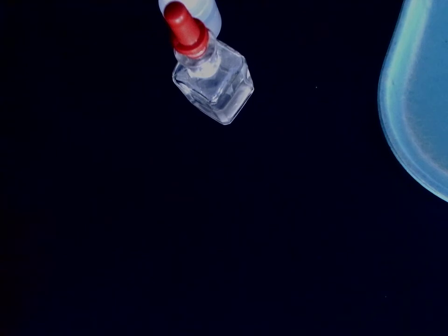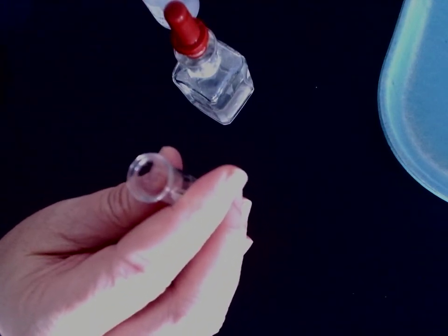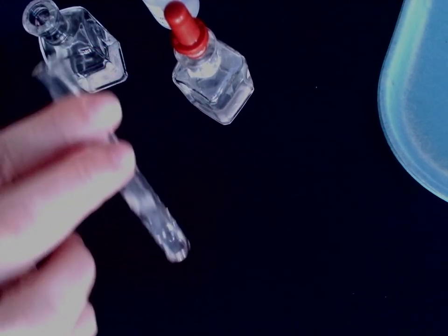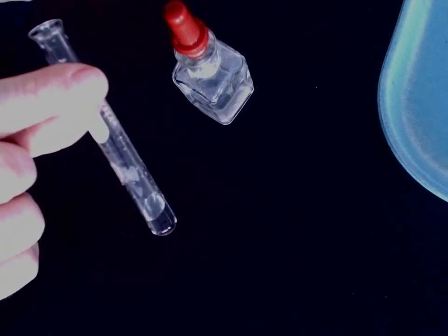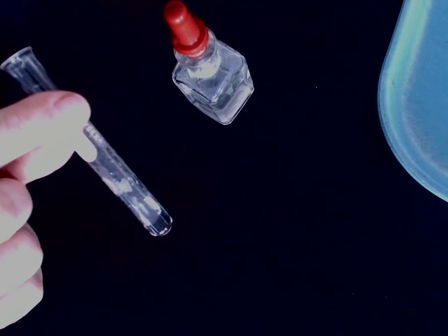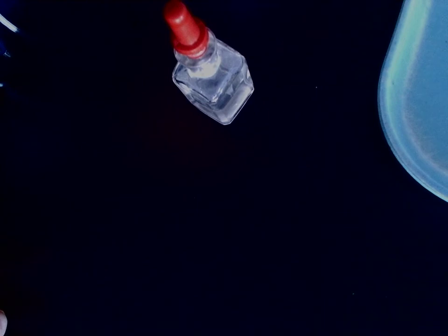And last but not least, we've got zinc nitrate and magnesium nitrate — there you go. That concludes the observation part of this lab. You'll now use those observations to finish up the analysis questions that follow the table. Good luck.